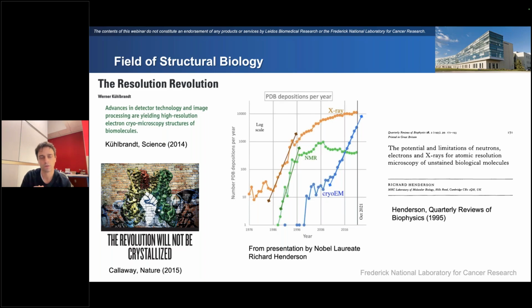So before the direct electron detectors were commercialized and given out to customers, the technology that was used was actually scintillator technology, where the electrons would strike the scintillator. The electron signal would be transferred into photons, and it was actually the photons that were detected by the cameras. And as you can imagine, having this middleman in the process really adds noise to the entire system.